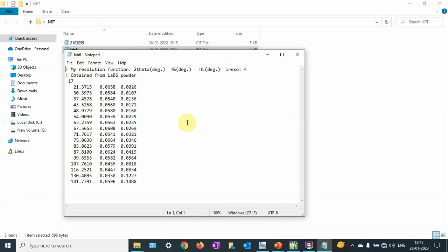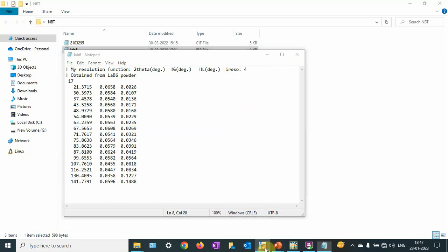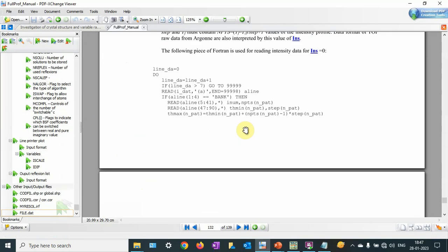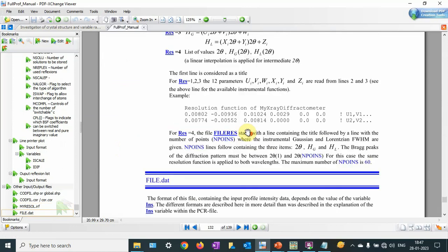Then this is the LaB6 IRF file. I have collected this data from the diffractometer. LaB6 is lanthanum hexaboride — you can use it as a standard. The first line is your initial 2-theta, the second line is the Gaussian contribution of the peak, and the third is the Lorentzian contribution of the peak. I have already made a video on how to make an instrumental resolution file. The format is resolution format 4, and you can refer to the FullProf manual page 132 for this format.